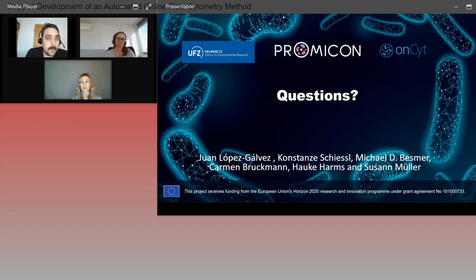Yeah, for this specific application, we chose DAPI over other stains because DAPI has a very high resolution. This allows for better separation between different sub-communities of the bacterial community. For instance, in the case where you have more than 50 members in one community, if you use a stain that does not have this high resolution, you will not be able to resolve all the members of this community. So DAPI gives more resolution power in this case. That's why we chose it. For community composition, yeah. So I think that's also something that goes back to that first question.